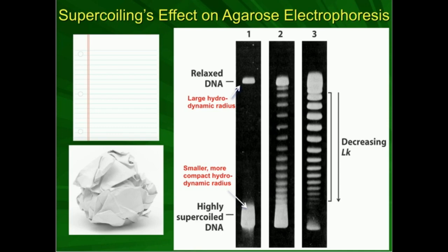Depending on your biochemistry course or cell and molecular biology, genetics, cell bio, whatnot, you've probably seen a figure that looks something like this. Now, we know two things. Number one, we know that if you take DNA of any kind, you can electrophorese it in agarose medium, and the DNA, depending on its size or its number of base pairs, will migrate a certain distance down the gel. We hopefully know that larger DNA does not move as far and smaller DNA moves much farther.